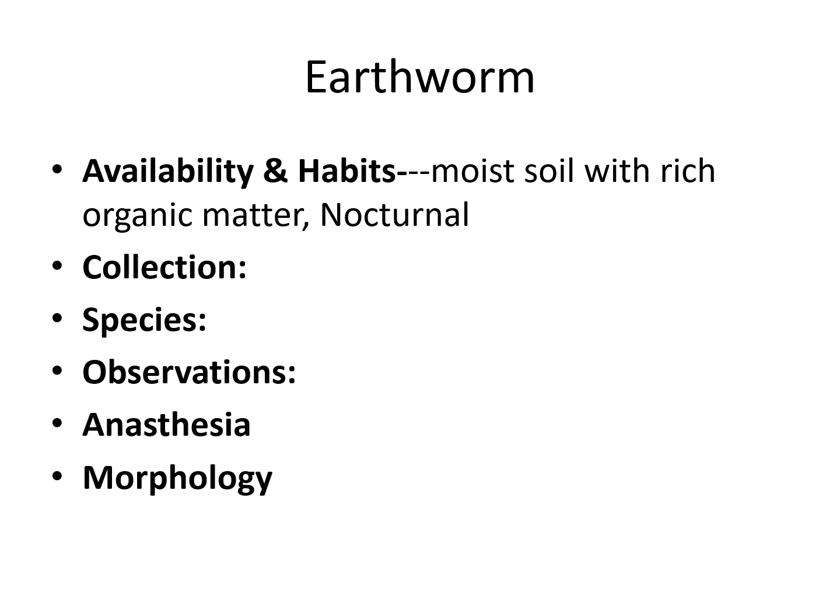If we put an earthworm on a sheet of paper and observe the mechanics of crawling, we could see the peristaltic movement of circular and longitudinal muscles, and these muscles contract alternately to help the animal crawl, and the setae anchor the different segments of their body to help in burrowing and crawling. So they could produce a scratching noise on the paper.